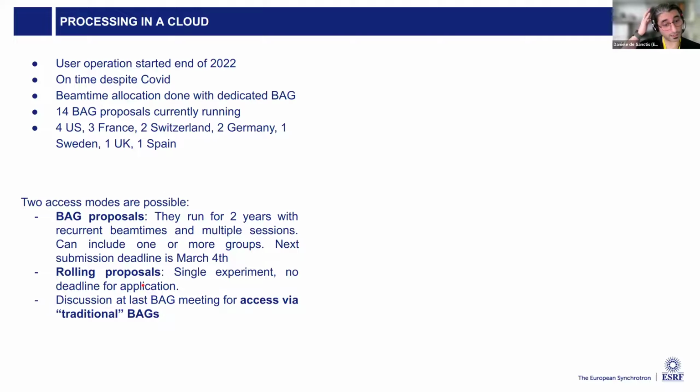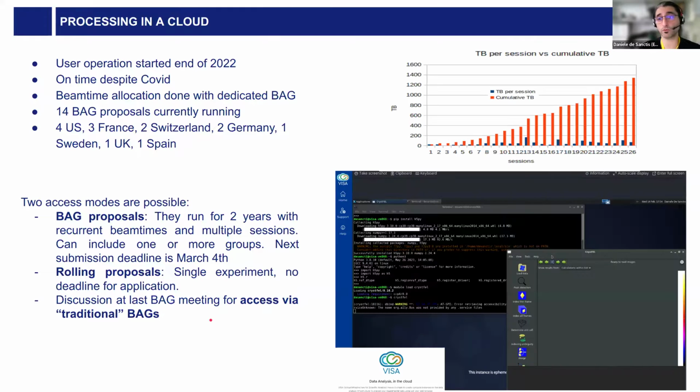But I can say that at the last BAG meeting, we started to have discussion to open the access to the beamline via traditional BAG applications, where users can ask for a few shifts on ID29 to initiate some room temperature time resolved studies on their project.